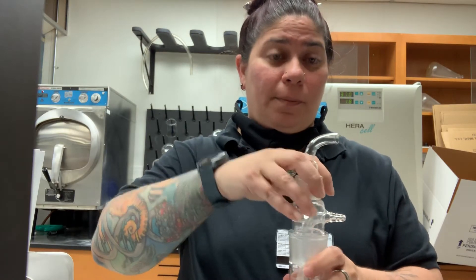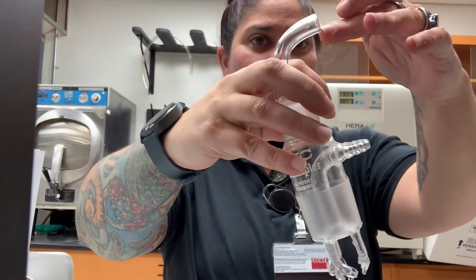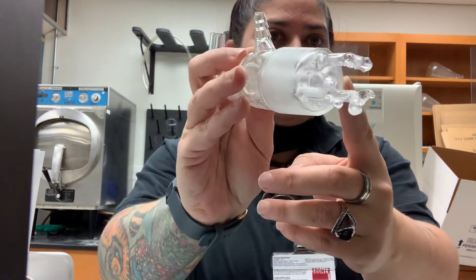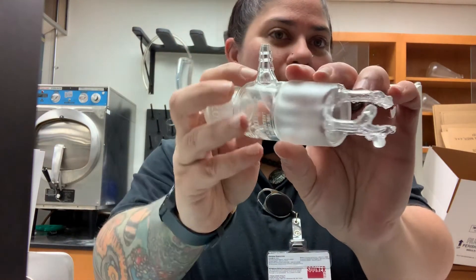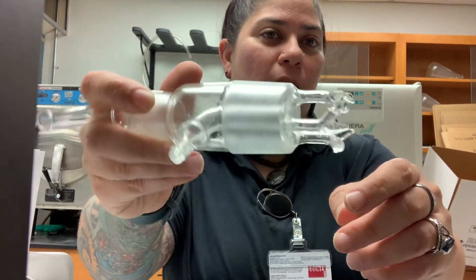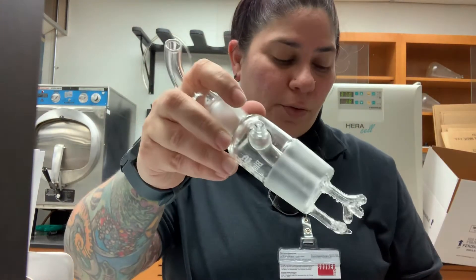The inlet, or the top portion of the biosampler, is designed to mimic the human trachea. It then sets into the body of the sampler. The airflow through the inlet is directed down and out through three critical orifices, which bound the flow rate at twelve and a half liters per minute. The angle of these orifices determines the flow of the aerosol through the device.